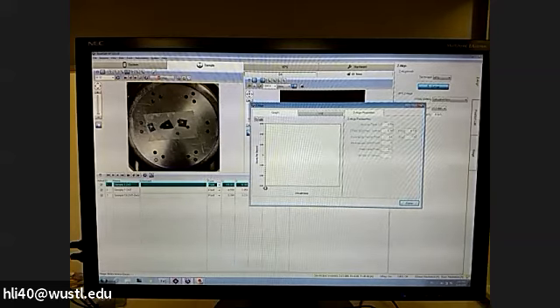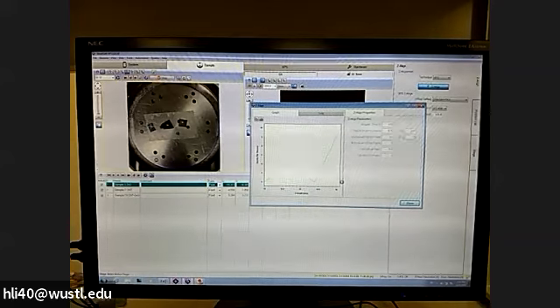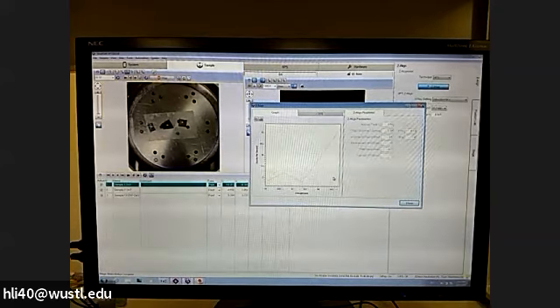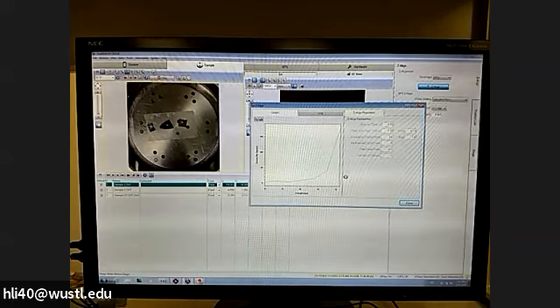Okay. So in the beginning, you should see some noise. You see now the count is coming down. The noise is normally below 50, so this is normal. If you only see a flat line there, which means the X-ray source is not on, in that case you need to report to me right away, which means we have some trouble. Okay. So now, after you move to a place, you see a significant increase of the count.